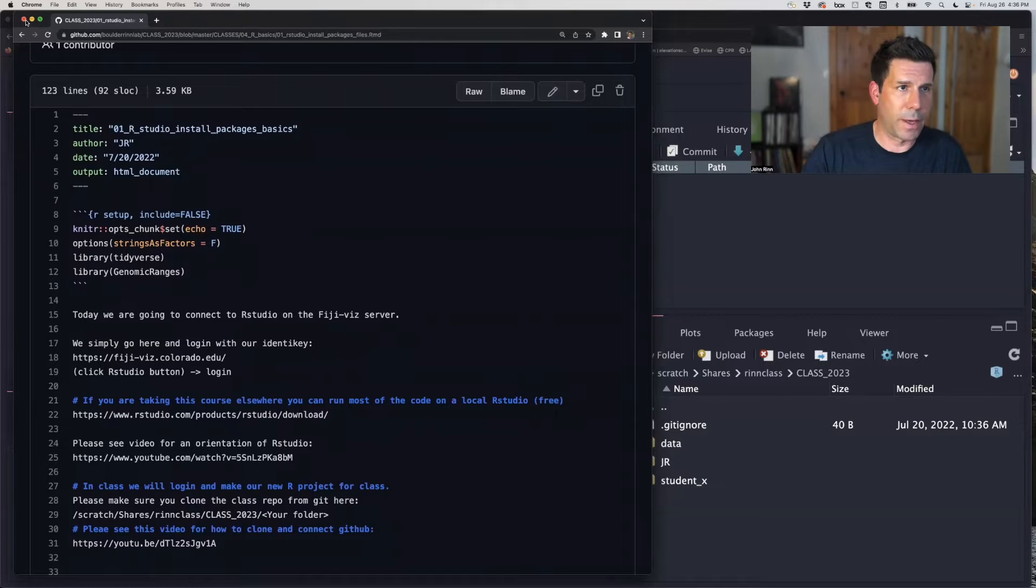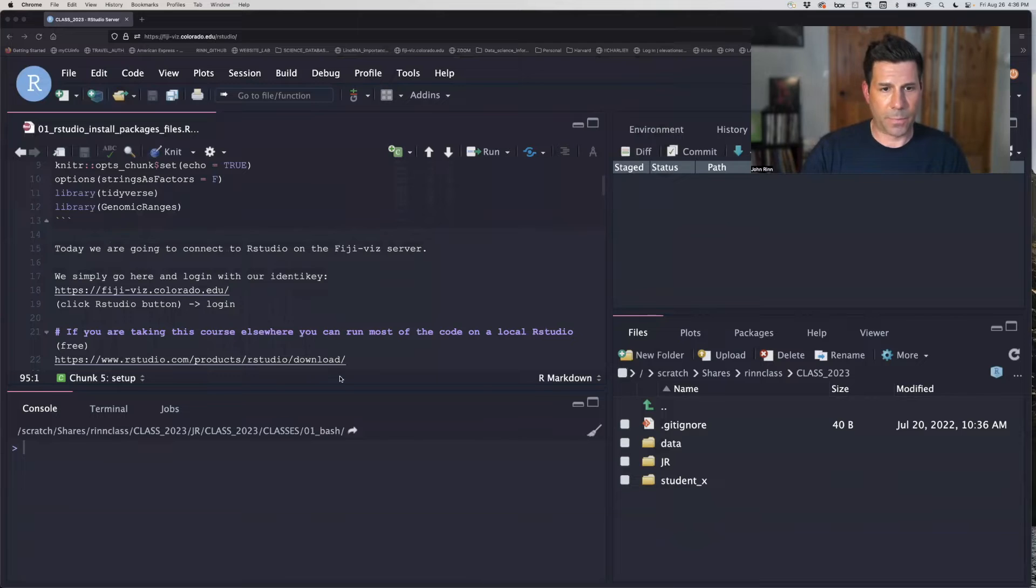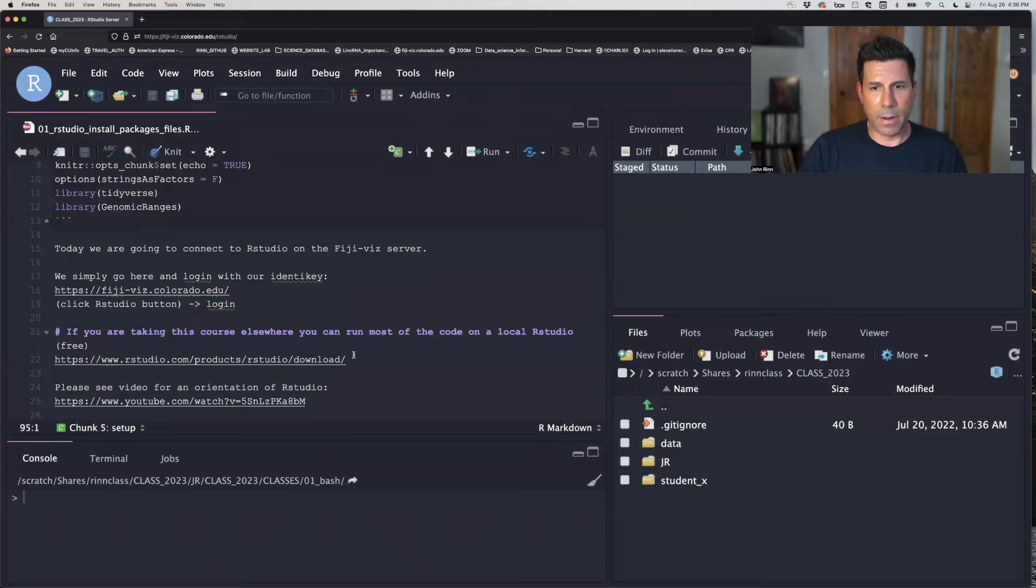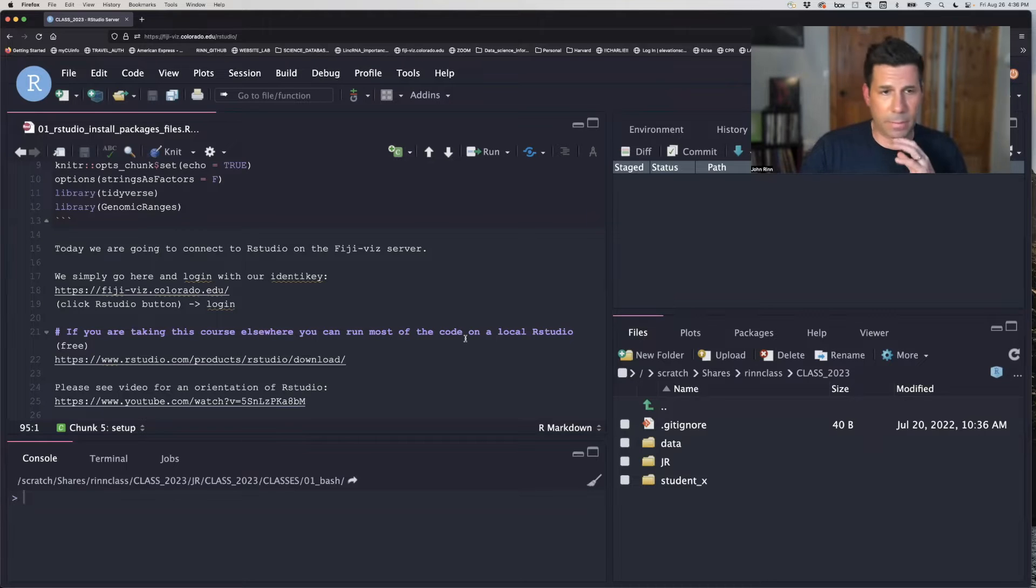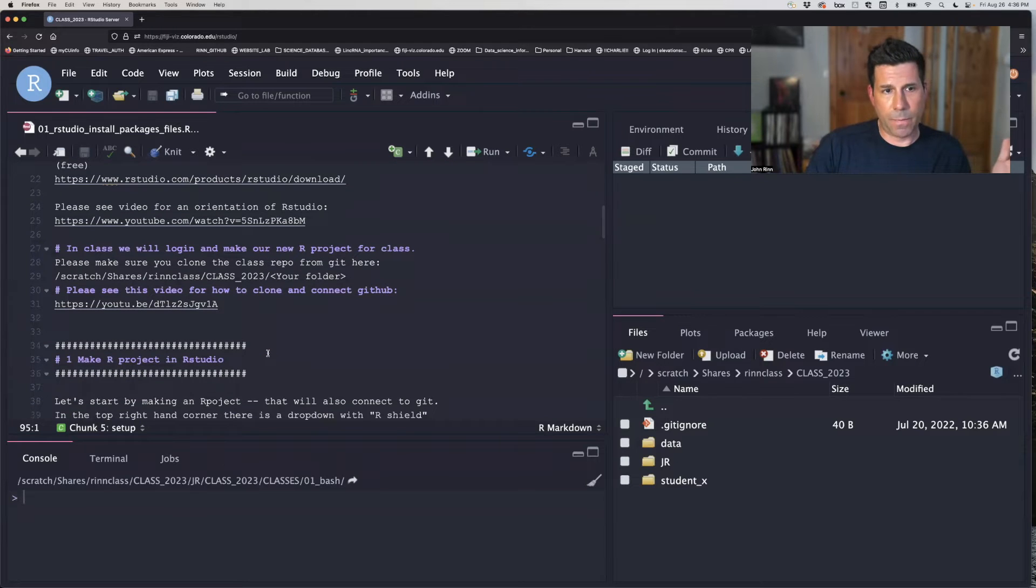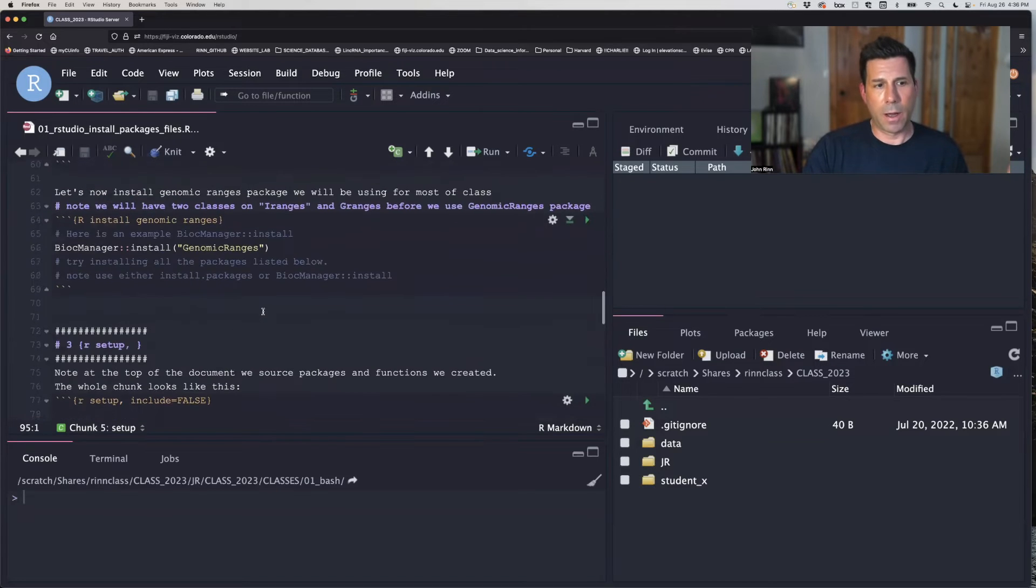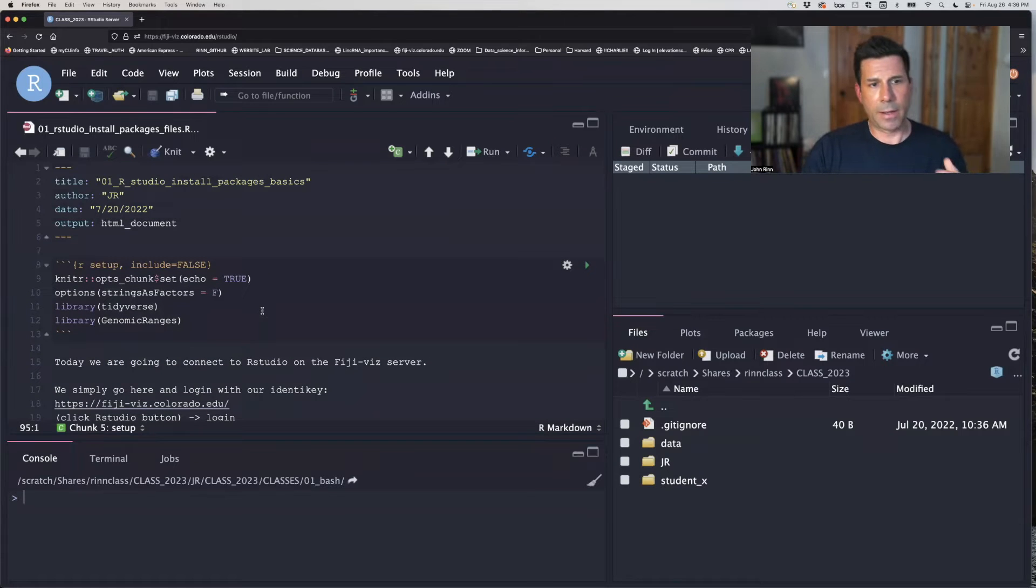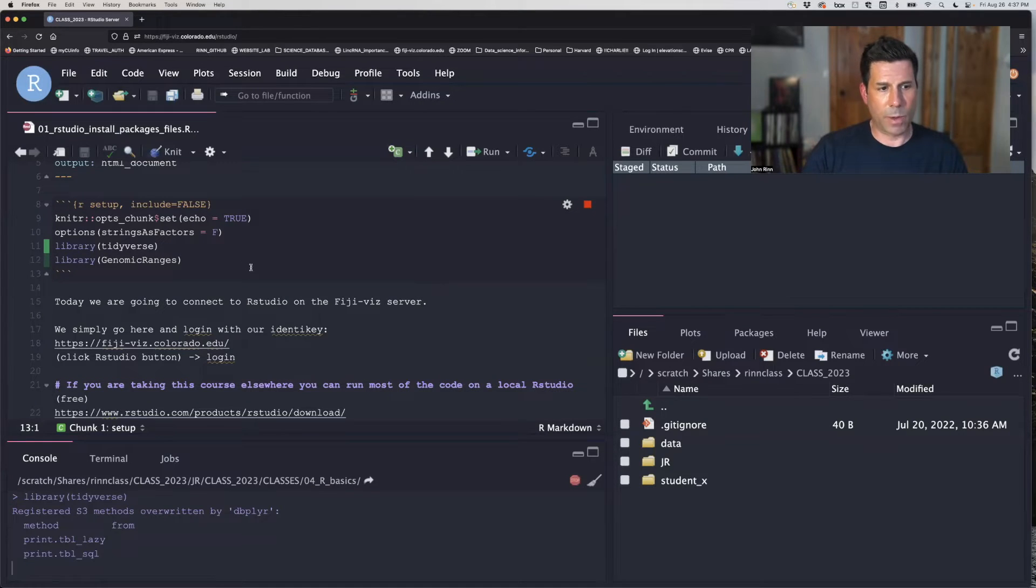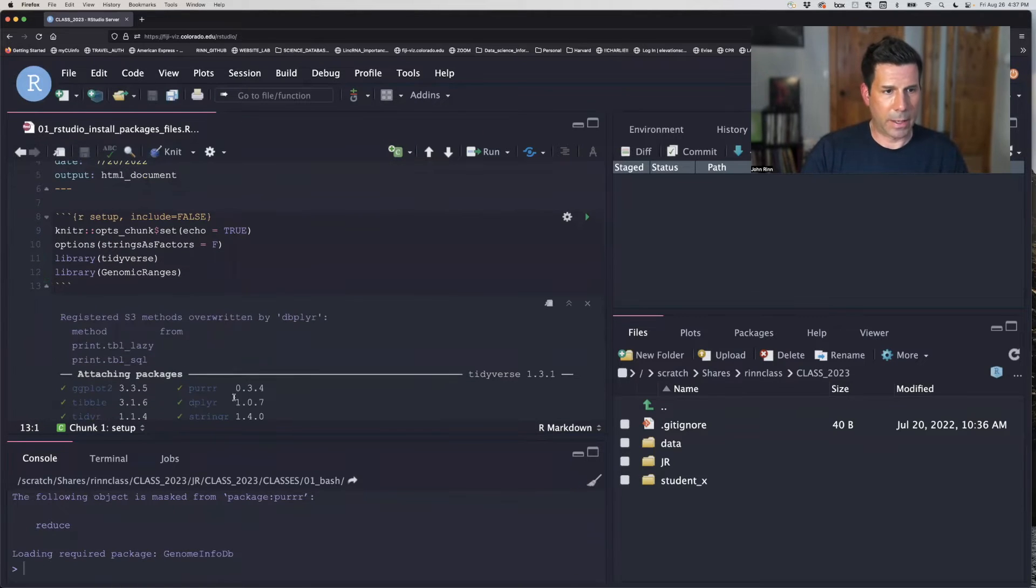So this I am going to move, as usual, into the class RStudio. So you can get RStudio at home for free and download it and open it up and navigate to wherever you have ran your NF core ChIP seek pipeline. And this is the markdown file that was in GitHub. And so this pane right here tends to be where your code is or things you're going to run like we are today. And it's sort of your guidebook of running code where you can actually run it in real time. So this is the code pane.